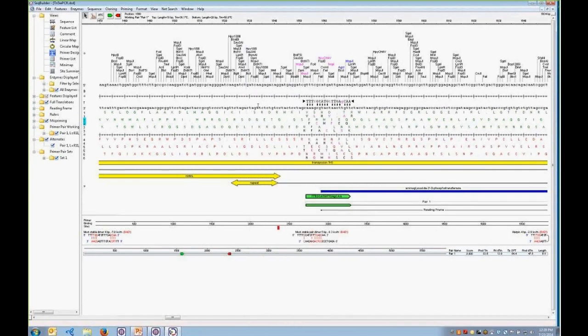So once you've created your primers, you can create a primer catalog that you can then use again in future projects. The primer catalog is a very simple format. I'm going to show you not only how to save primers that we've created within SeqBuilder, but also add primers that you may have created outside of the application.